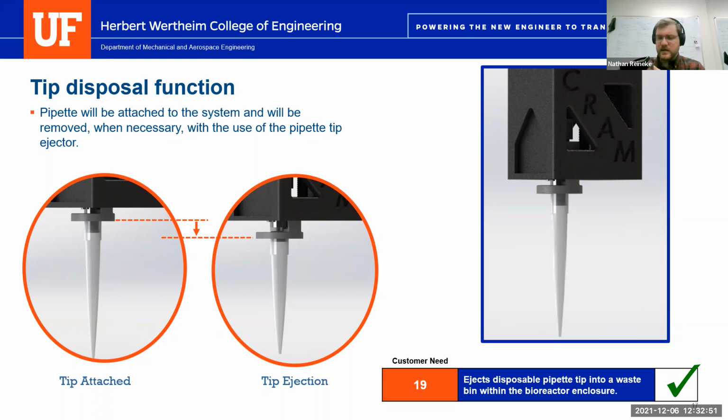So to make it a little bit more feasible, to give us more error, what we could do is add a bigger fillet on this end right here. Right now we have a very small one, but we actually have about 2 millimeters to work with.